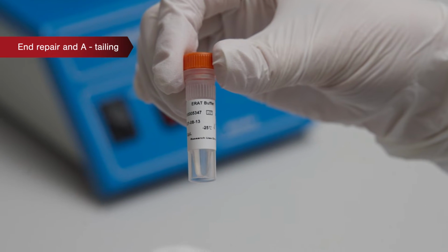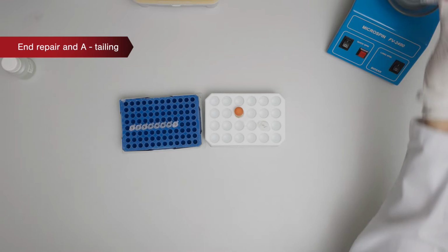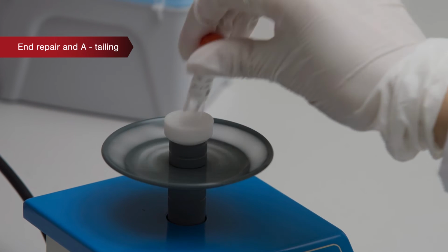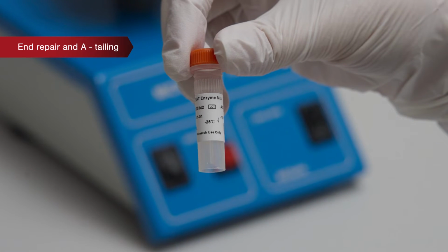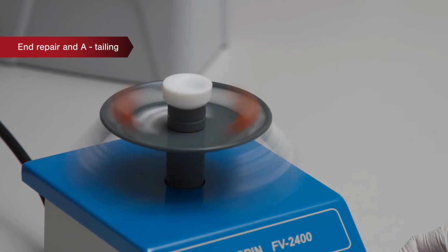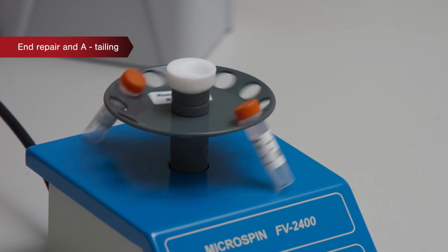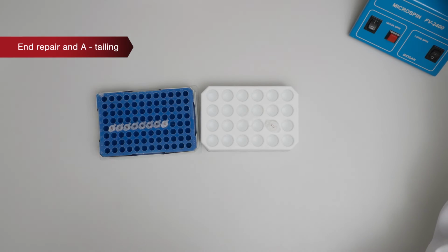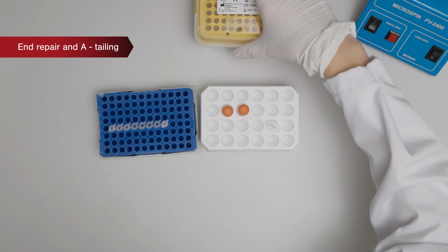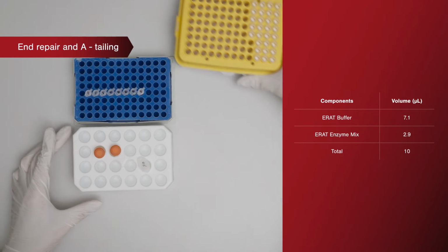To make an ERAT mix, you need to combine 7.1 microliters of ERAT buffer with 2.9 microliters of ERAT enzyme mix for each sample on ice. For example, if you want to work with 10 samples, you can multiply each of the components with 10.5. 0.5 will be in reserve for pipetting errors. So you combine 74.6 microliters of ERAT buffer with 30.5 microliters of ERAT enzyme mix.